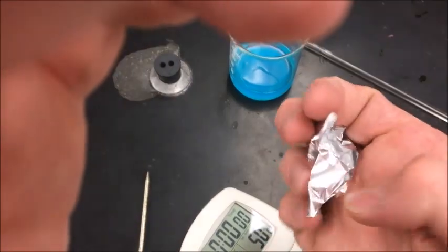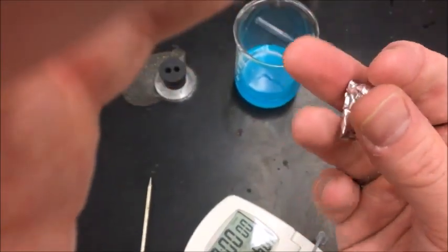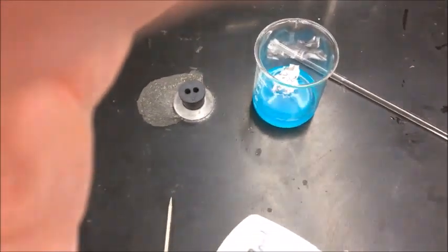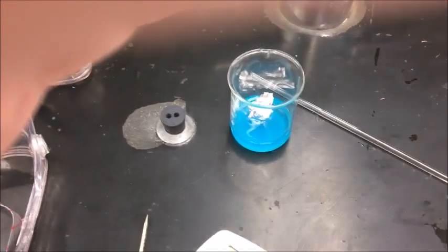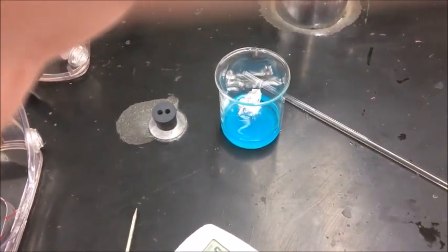Now what you're going to do is you're going to lightly crumple it, as so — not real tight, but just slightly. And then you're going to put it in the solution. And then observe.